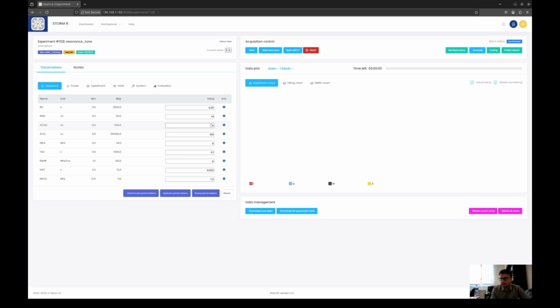So these basically are the delays before the start of an acquisition, and in this we give proper time for the experiment to settle, to avoid those transients and give time to the receiver to start the acquisition. And then here it tells the acquisition time, which is in microseconds. This is basically the time of the total acquisition, so this is the time in which the NMR signal will occur. Then the relaxation field at which we will relax our sample in a single block. This tau tells us how much time the sample will be in high field, the relaxation field.